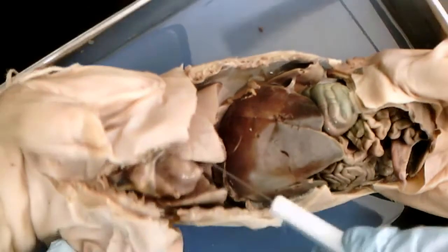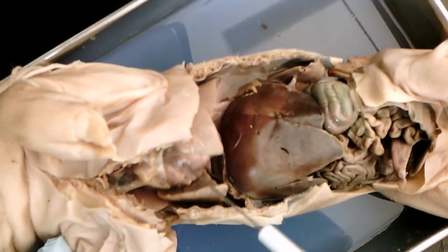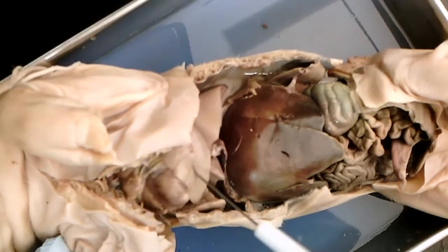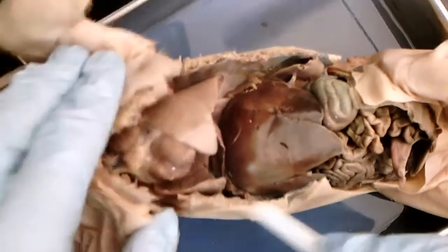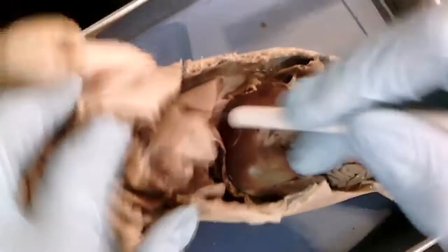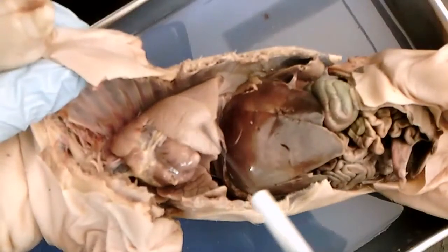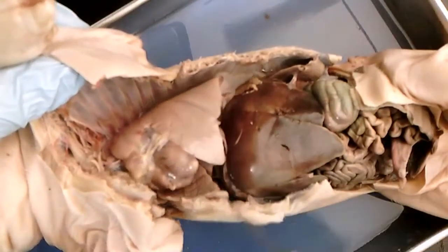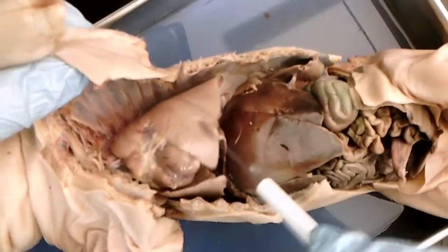All right. Can you kind of see what I'm moving around there? That is the heart. And what surrounds the heart? The lungs. So you have the heart and the lungs.